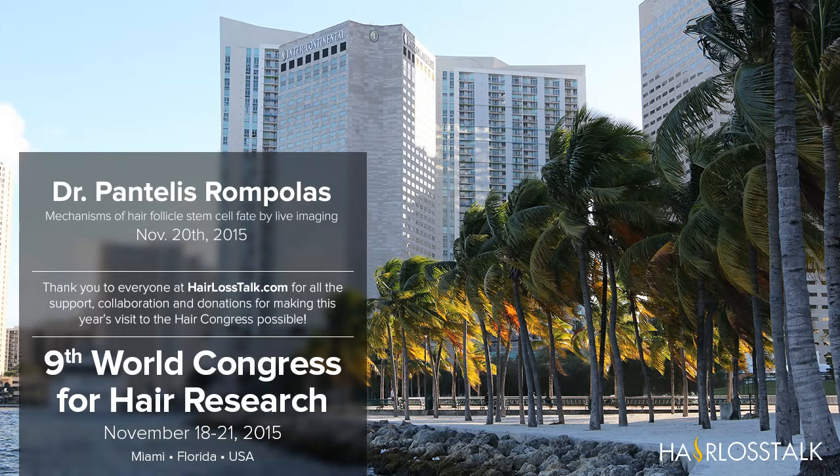And so in this experiment, we used a reporter to label cells exclusively outside of the niche. Here you see a hair follicle where there are no labeled cells within the bulge or the hair germ, but there are labeled cells in superficial layers, including the isthmus, infundibulum, sebaceous gland, and also the interfollicular epidermis, which is not visible in this because the plane is at the dermal.